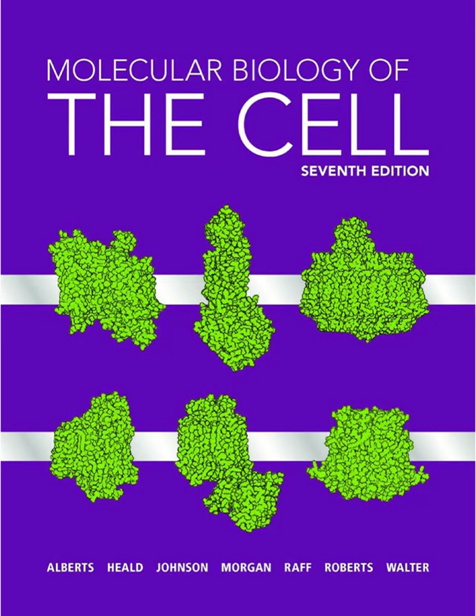The intensity of these signals varies depending on the surface topography. And that gives the 3D look. Yes, SEM images have a fantastic depth of field, so you get that really striking three-dimensional appearance, with highlights and shadows revealing surface texture. You usually coat the sample with a thin layer of conductive metal, like gold, to prevent charge buildup and enhance signal. What kind of samples work well? It's great for whole cells, tissues, small organisms, things where you want to see the overall surface architecture.